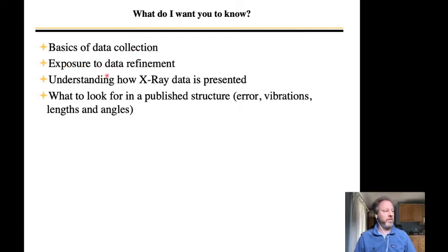Data modeling. Understanding how X-ray data is presented, very important for me. And then what to look for in a published structure, the errors, vibrations, bond lengths, bond angles. Those are the kinds of things that you can take a look at in a published structure.